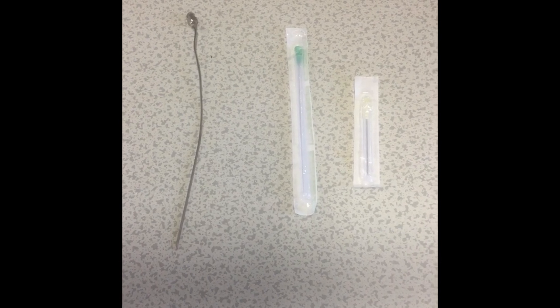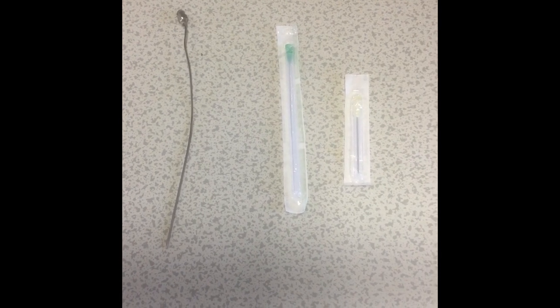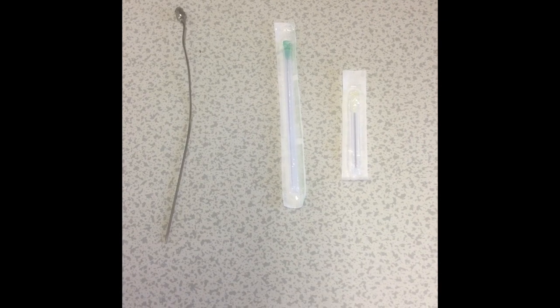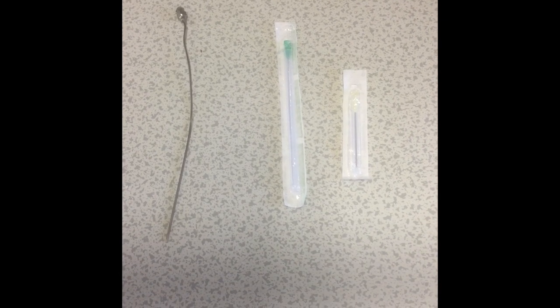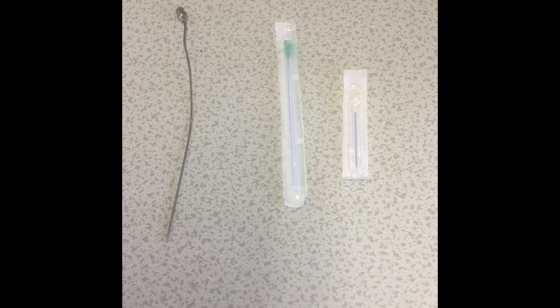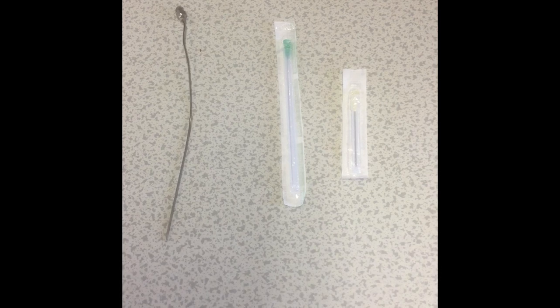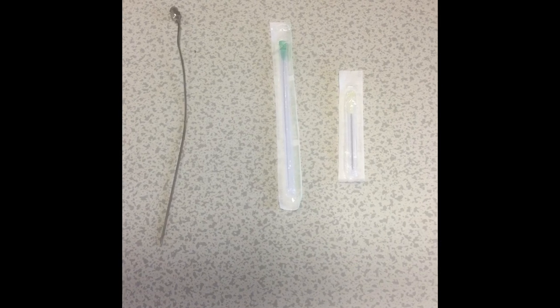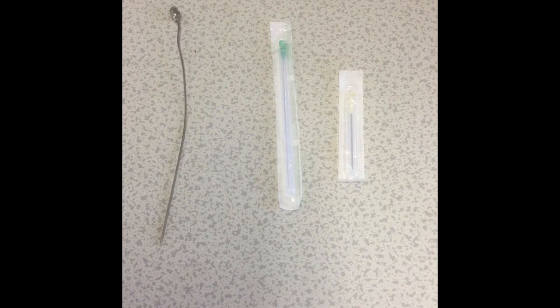Cleaning these metal needles will depend on what they have been used to transfer, and you should follow any special procedure outlined in the experimental script. If you are unsure, consult a member of the demonstrating staff. Once the needle is clean and dry, it should be returned to stores. Please take care when carrying them through the lab to avoid injury to yourself and others. Needles should always be carried point down.